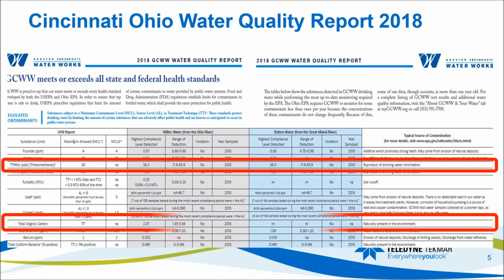Okay, and then a lot of municipalities and areas also report a TOC measurement. There is no defined maximum. Again, it's an indirect means of determining the cleanliness or purity of the water. So obviously, the lower, the better. So they actually don't put a max amount allowed in your drinking water, but it's good just, again, as a reference of how clean that water is.